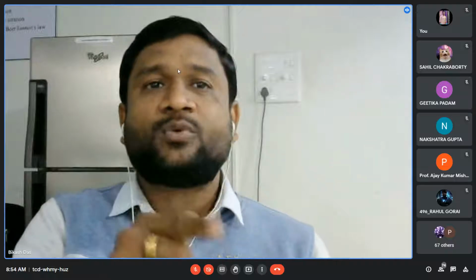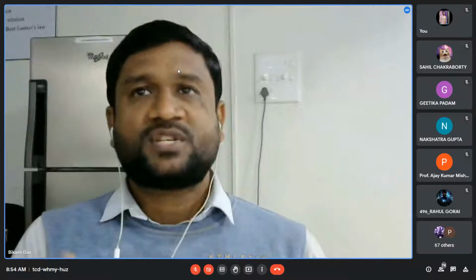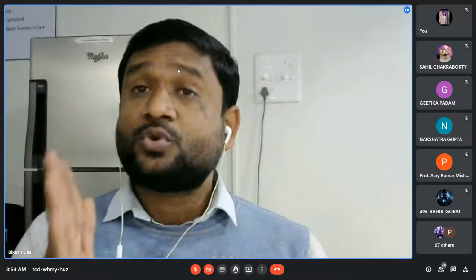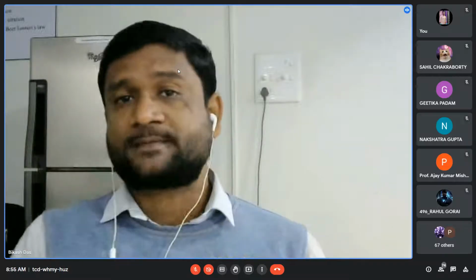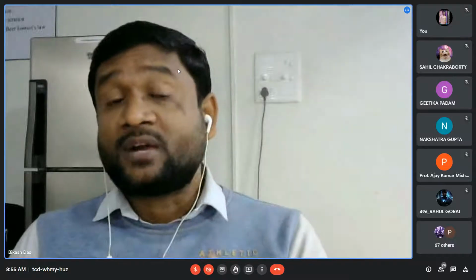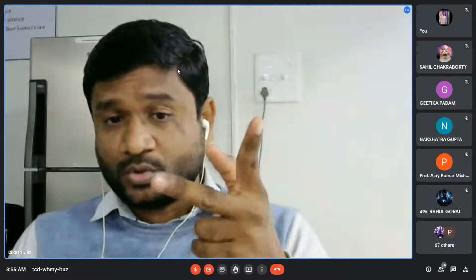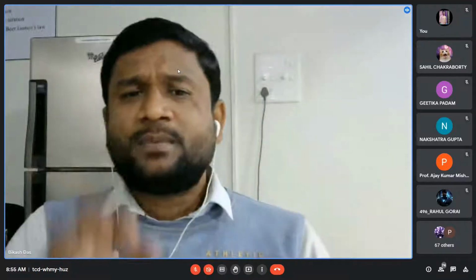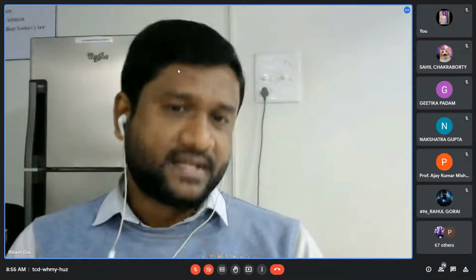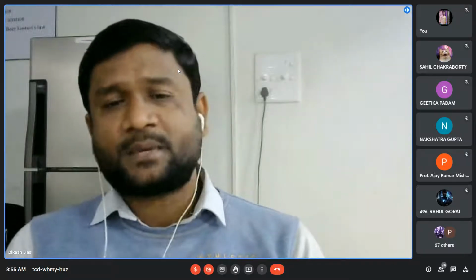The NaOH value at that neutralization point you have to use in your calculation, which is the law of equivalence, N1V1 = N2V2, because to find the strength of any unknown solution, first of all you should know its normality. The unknown substance here is HCl, so you first need its normality, and to know that you follow the law of equivalence N1V1 = N2V2. Once you know the normality, simply multiply by the equivalent weight of HCl. So easily you can find the strength of HCl without using any indicator. This is a very easy experiment.